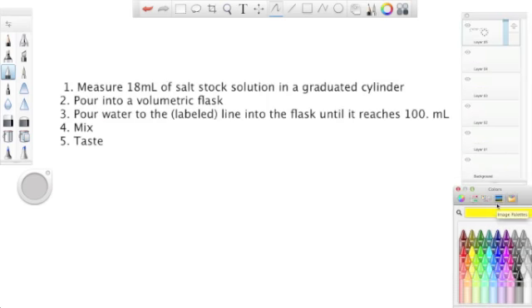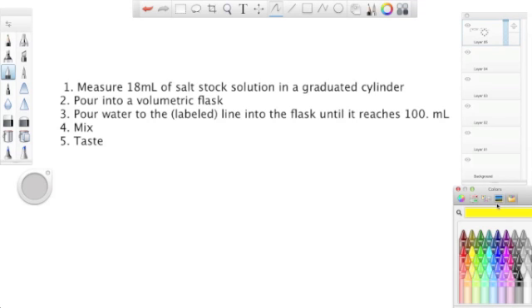Steps to this solution are similar to the previous one. First, we measure 18 milliliters of salt stock solution in a graduated cylinder. Then we pour it into a volumetric flask. Third, we pour water to the labeled line on the flask until it reaches 100 milliliters. Then finally, we mix it and taste.